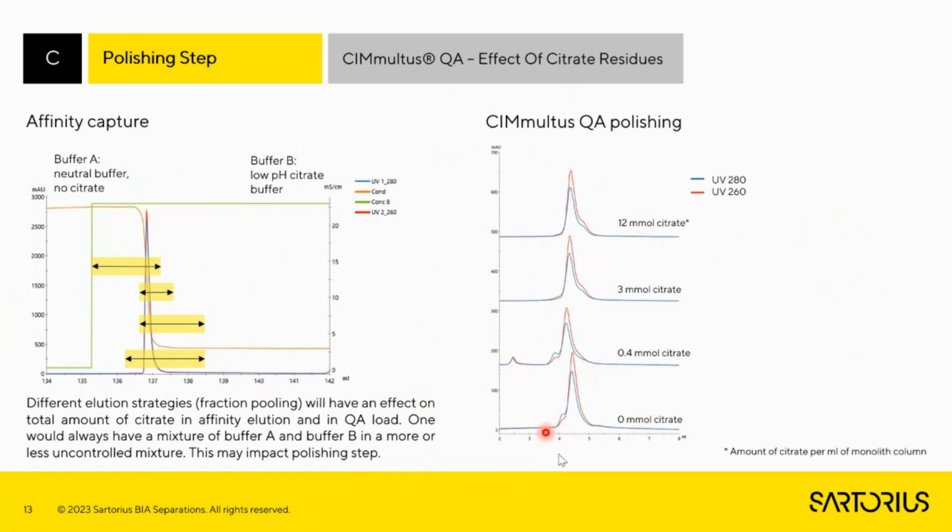And we see if there is no citrate present, we see, let's say, a textbook QA-looking peak. So we have the empty, and then we have the full capsids. But when we introduce those citrate ions in there, we see that gradually we have a higher percentage of those damaged capsids, so the third peak, and also omission of the first empty peak, as well as if we look at the time where they elute, they usually elute earlier on.